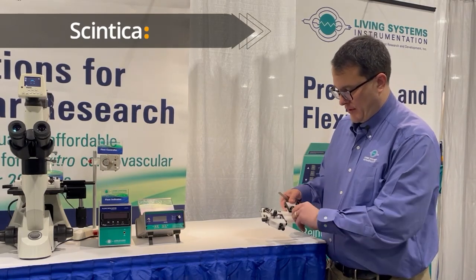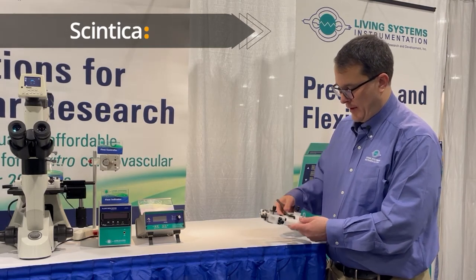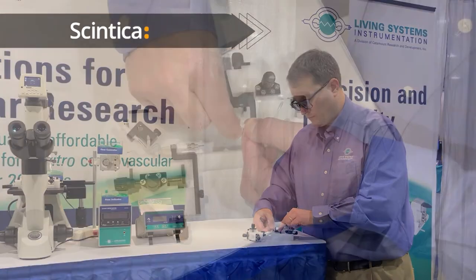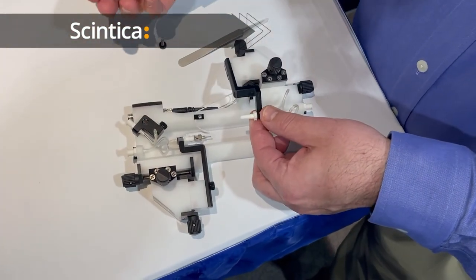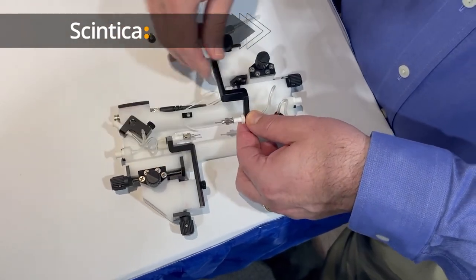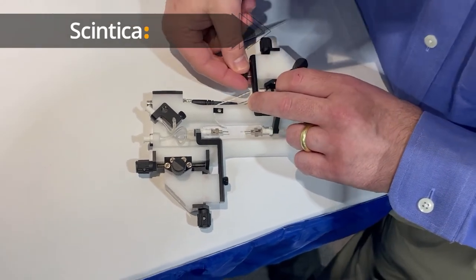They're easily changed just by removing the needle hub from the luer port, and that can be done here by loosening this screw, pivoting the cannula arm up, and then removing the cannula and replacing it with an alternative size, and then it locks back down.